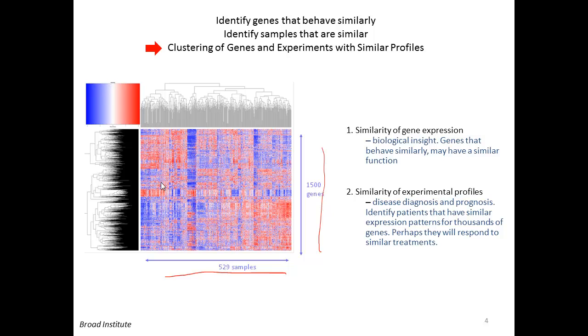Again, genes are in this column, and here's a set of perhaps 40 genes or so that have high expression. Here's the legend for high expression versus low expression. High expression in these first 100 conditions, lower here, higher here, and again, the idea is to find genes that are behaving the same and also to find samples that are behaving the same.